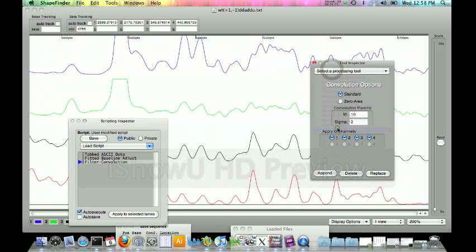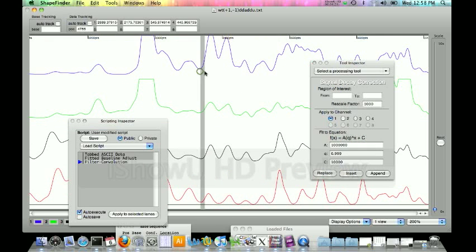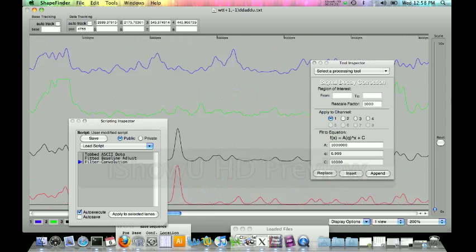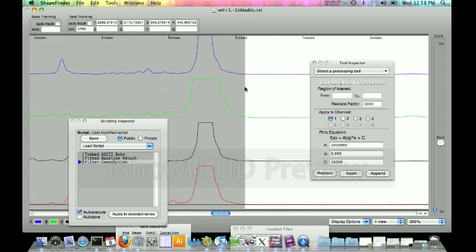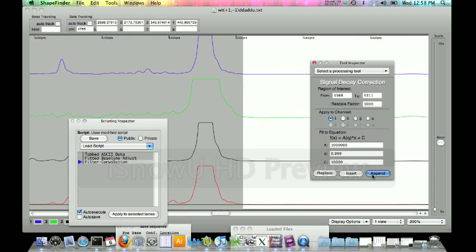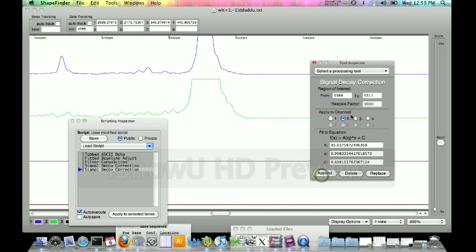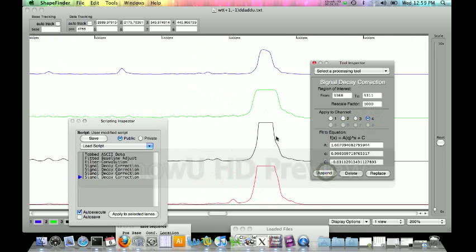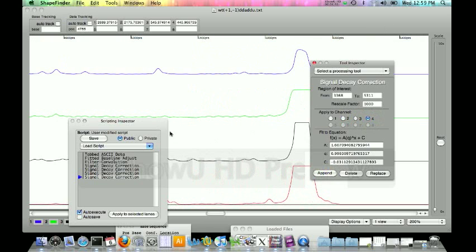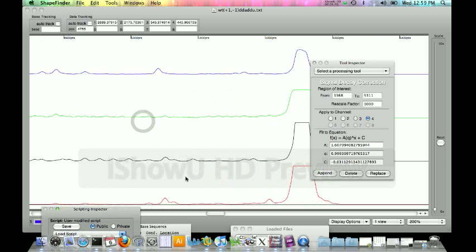We're going to go ahead and just reapply the signal decay correction again directly to the right of the RT peak, but include the primer front again and you have to apply it to one channel at a time. So first channel, append. Second channel, our append button jumped places now, it's on the left side. So click append again, third channel, append, fourth channel, append. You can see the data kind of scaling itself as you go through the signal decay correction.